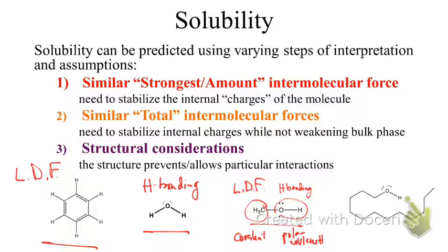Good answer. Let's mix them. So we go into the lab, we mix them together and see if they mix. Indeed, they do. Okay? What happens if we try and mix methanol with benzene?